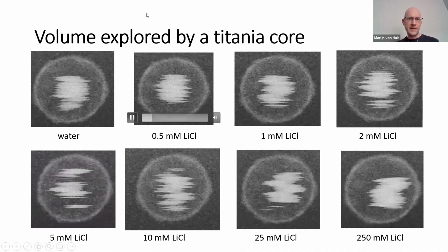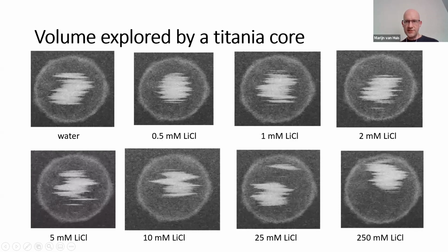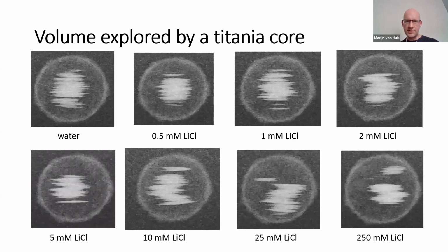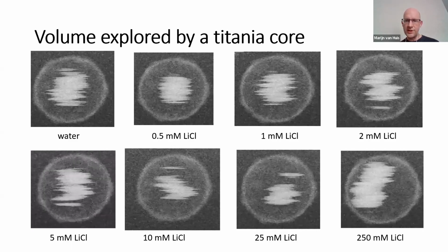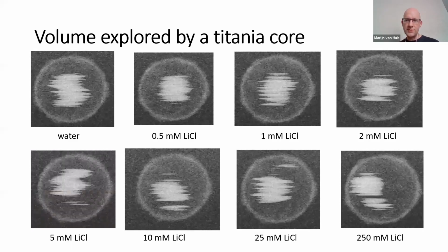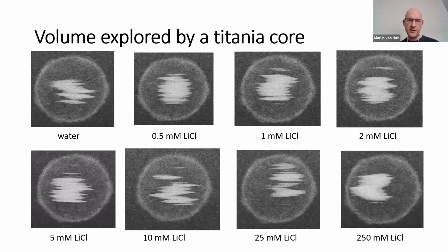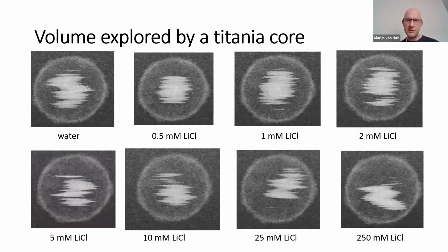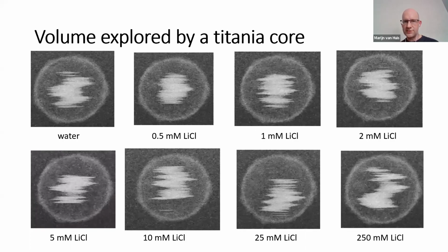Yes, there we are. So here you see 8 movies playing at the same time. You see the stripy pattern because the scanning is not fast enough to capture the complete movement by the core. But you can see at the same time very well that sometimes the core is quite confined at the center of the shell, and sometimes the core is exploring the entire cavity of the shell.